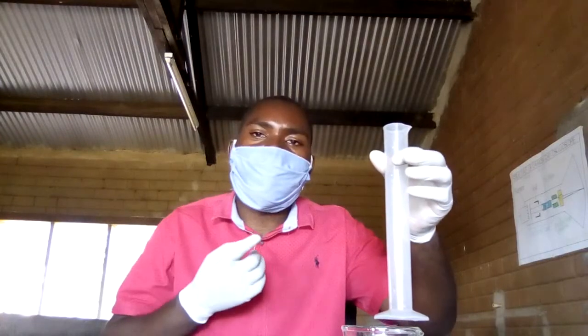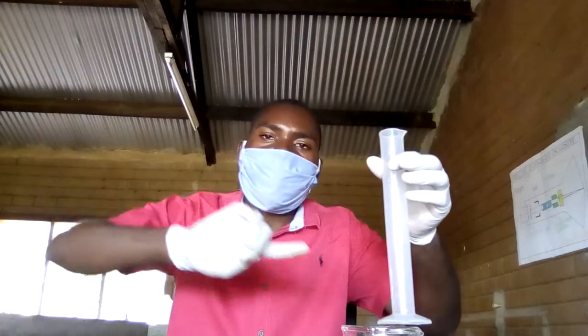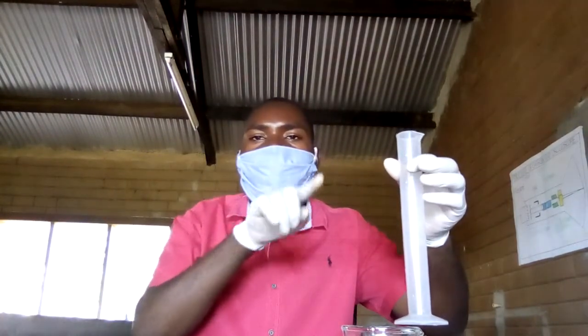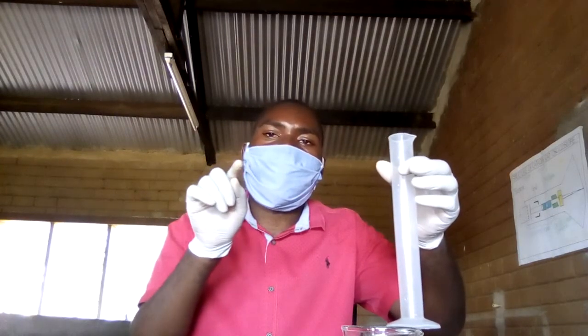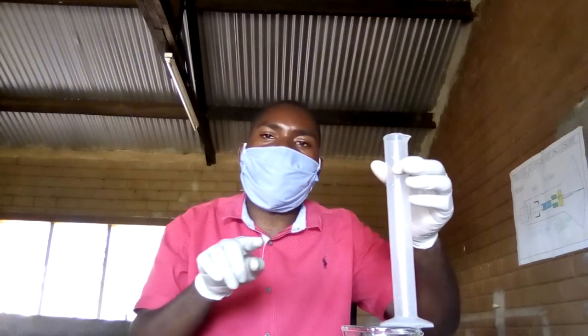Remember that when getting the volume from the measuring cylinder like this one, make sure that your eyes are straight on the meniscus. The meniscus is a curve going down like this. That is the curve we are talking about. You are not supposed to read the number at the point where the curve ends. You should read at the base of the curve.